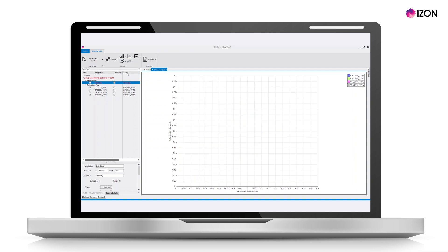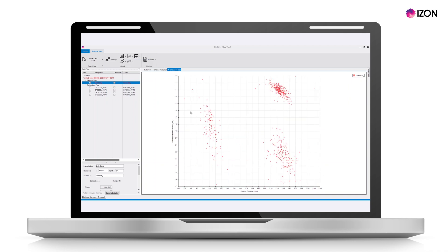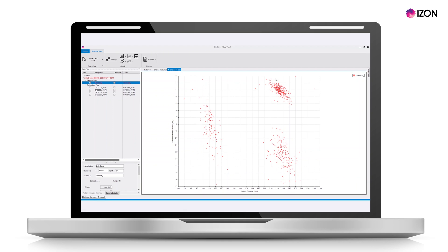Under histograms, the charge histogram will now display the distribution of the charges within the sample. Under scatter plots, the charge vs. size plot can now be viewed, showing the population distributions by both size and charge. As you can see from this sample, all three populations have been resolved, with the less charged CPN200s separated from the higher charged CPC200s.